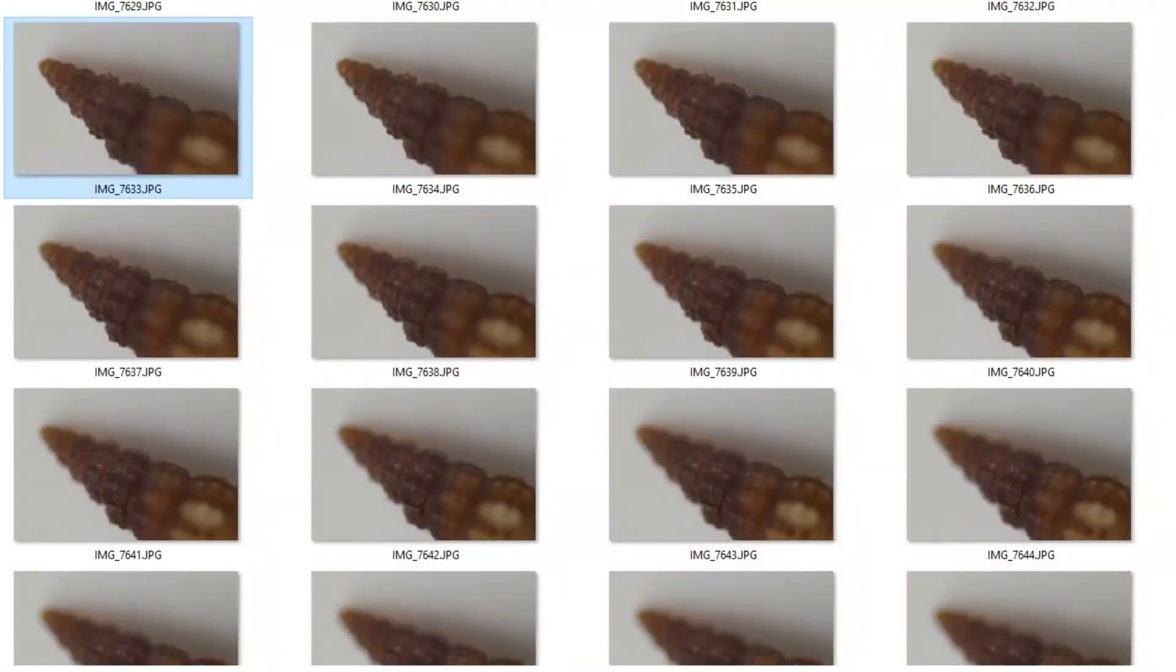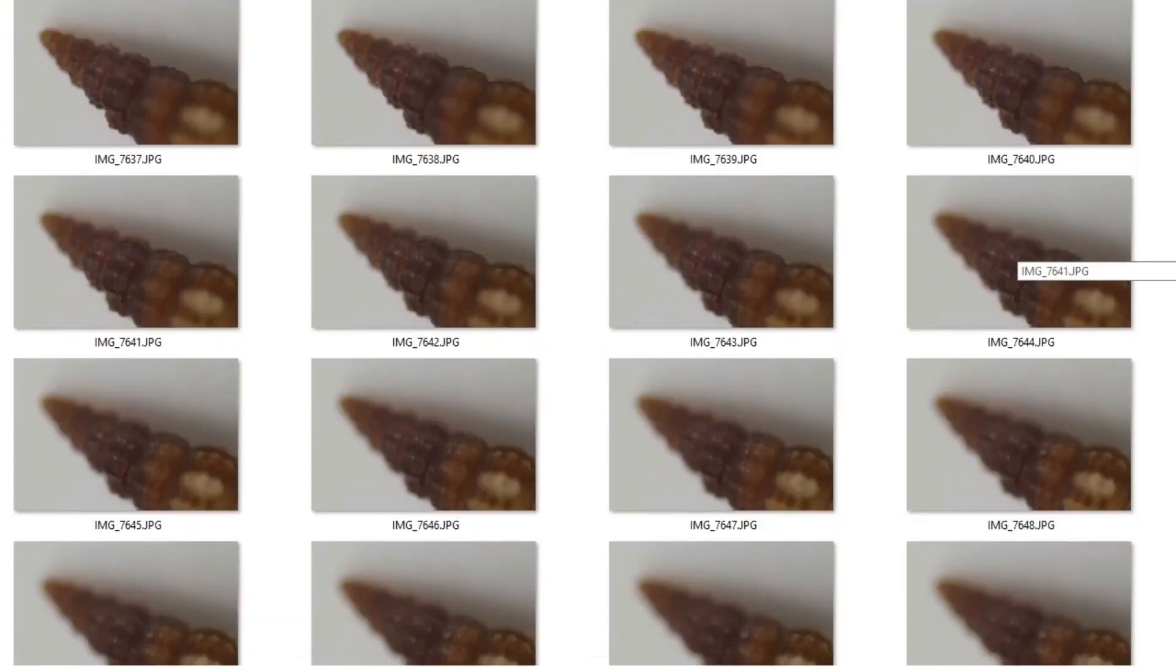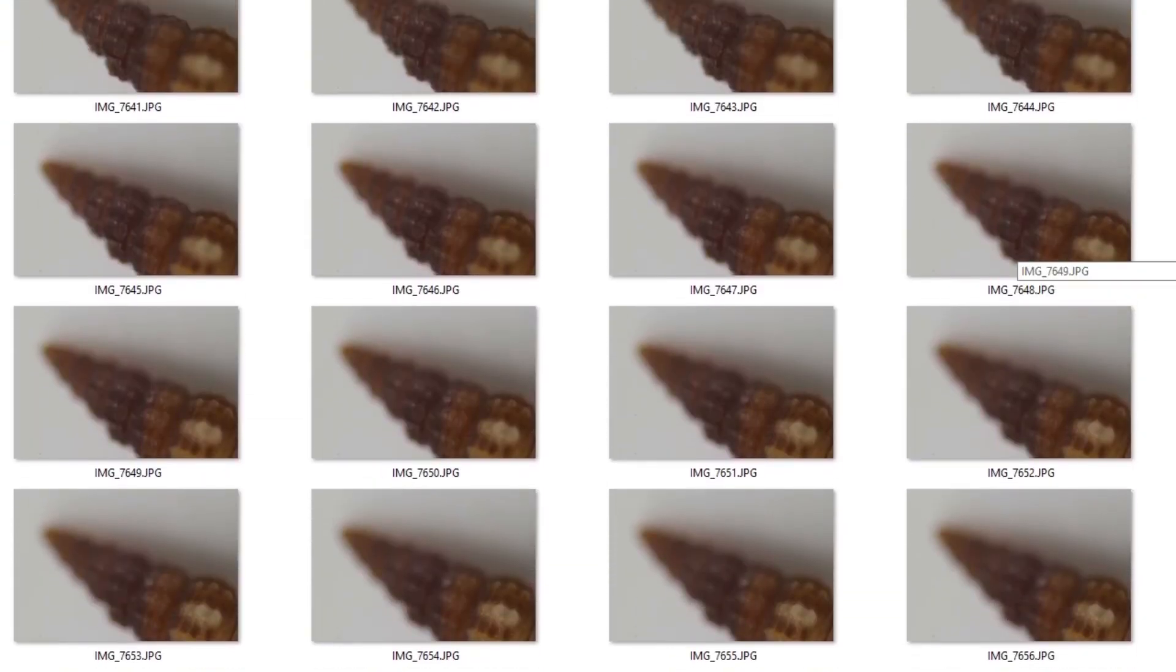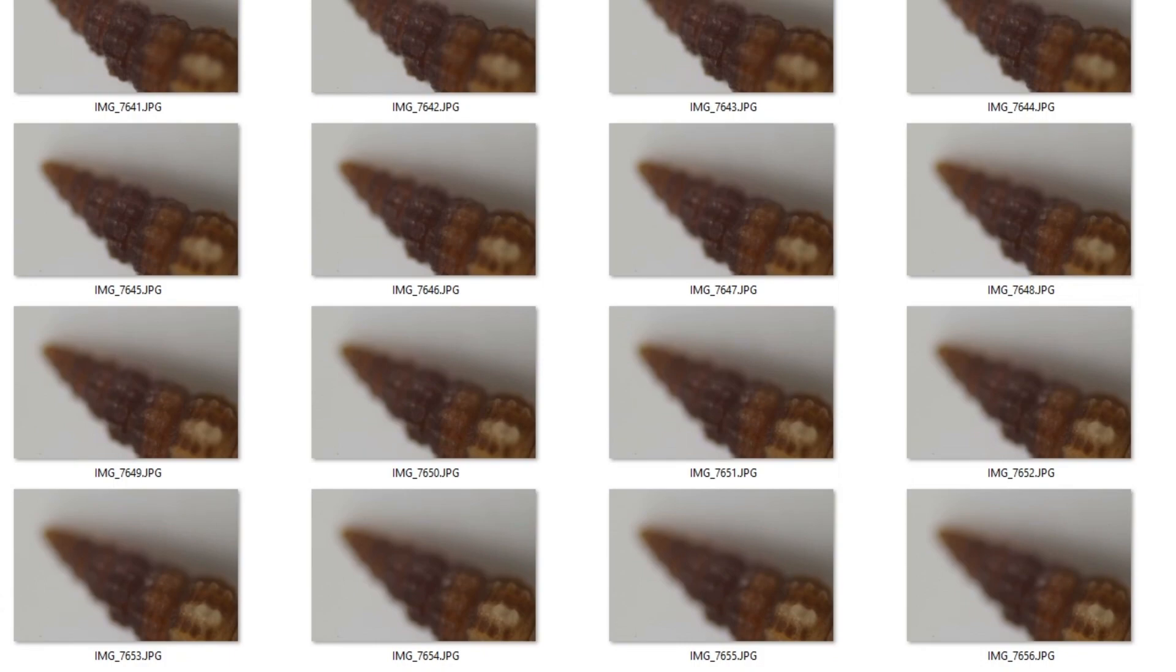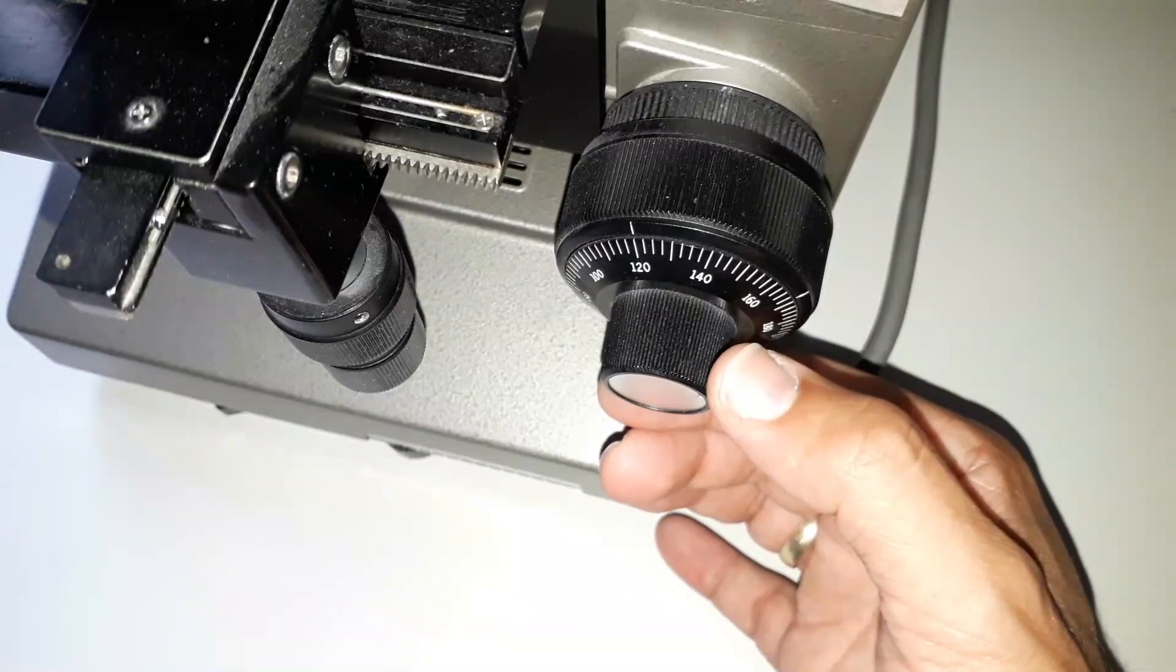So the first thing that you have to do, that's basically step one, is you have to take a series of images all of a different focus and what you have to take care of is that the first image is at the very top of the specimen in focus and then you always turn the focus a little bit and progress further down until you've reached the bottom part of the image.